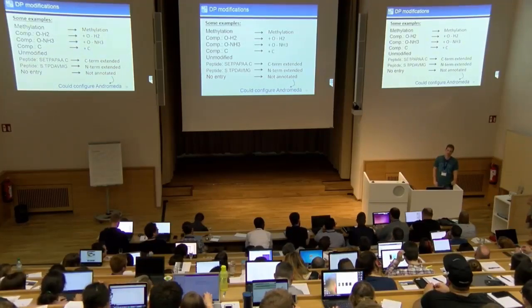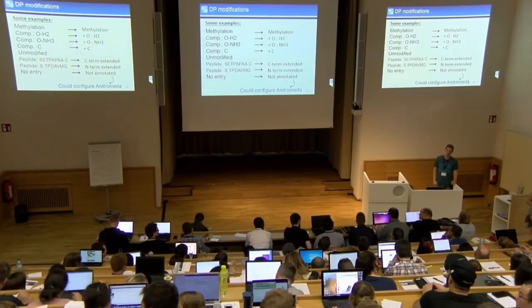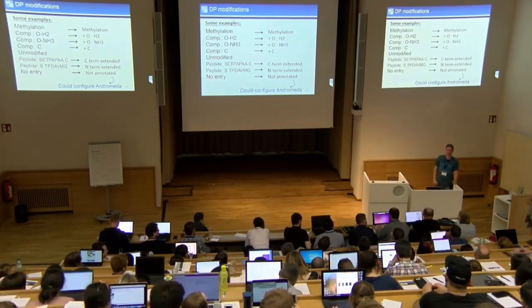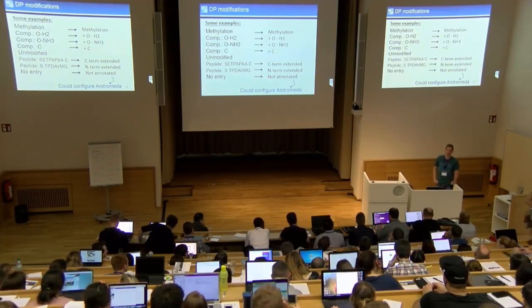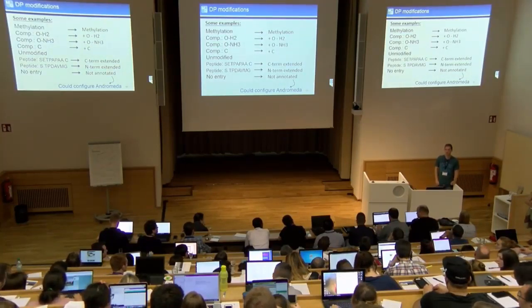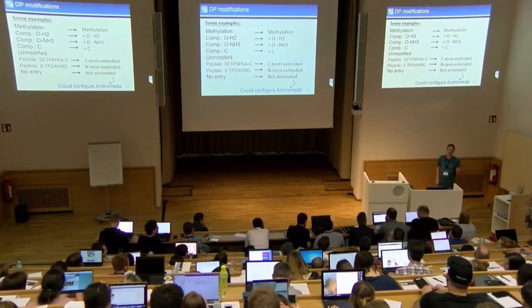And how many amino acid extensions are permitted? I'm not sure if there are limitations. I think whatever delta mass you have, Andromeda will try to match the modification to it. If it's multiple amino acids, then it will be multiple amino acids. But that means that a short peptide with variable numbers of added amino acids will create any amino acid combination from that. Yeah, but then the best scoring one will win.